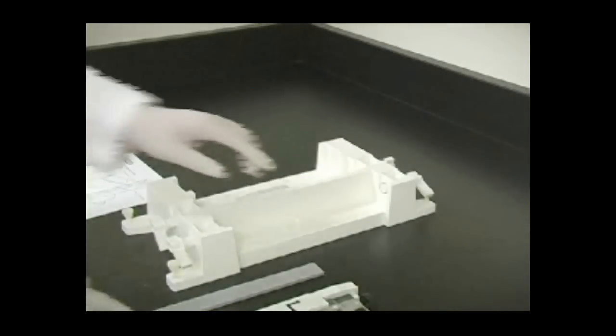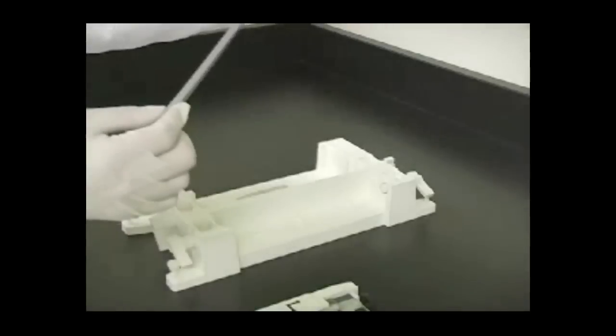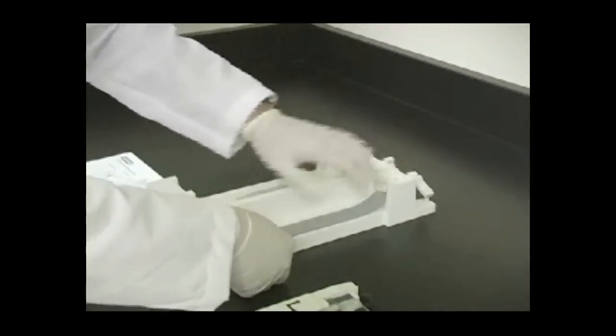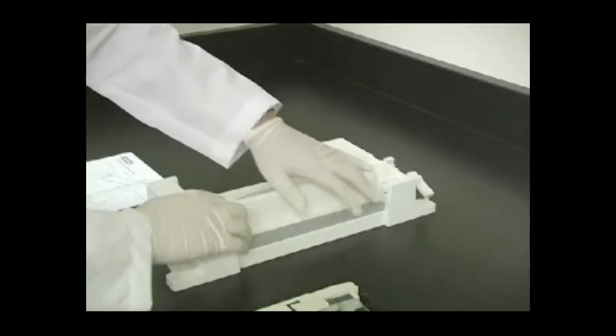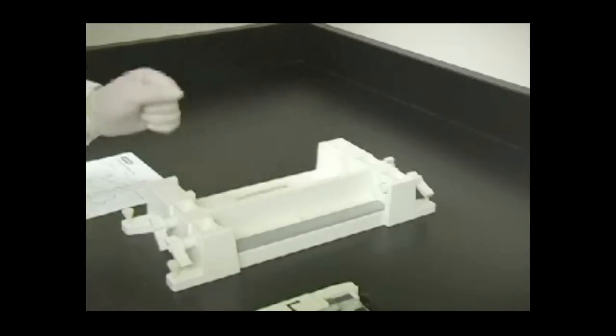Place the casting stand on a flat surface. Place a foam gasket in one of the casting slots. Check to make sure the gaskets are clean and free of residual acrylamide. This will help ensure a good seal.